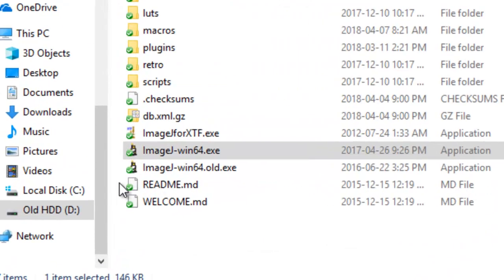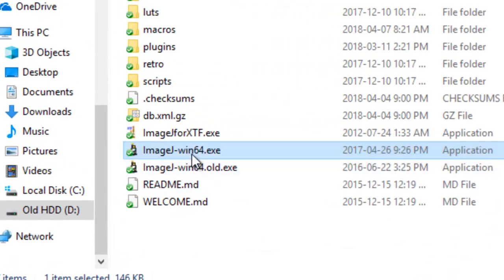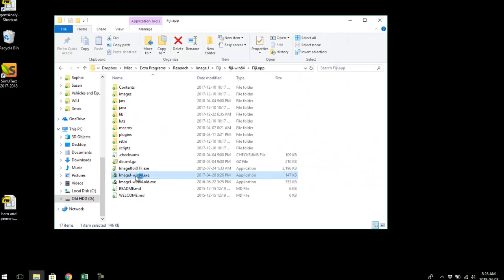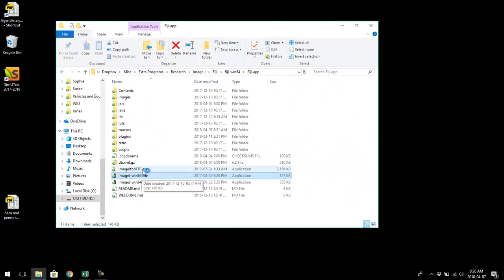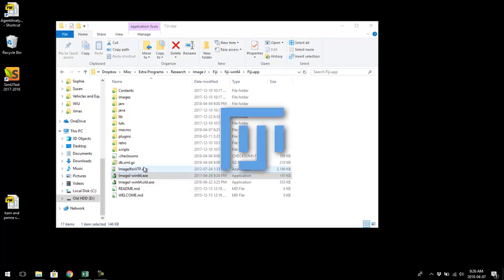The first thing we're going to do is launch ImageJ. The new version is called Fiji. You don't have to install it — you just have to have it on your hard drive and double click the .exe file. I haven't tested this with other versions of ImageJ, so I don't know if it works with older or different versions, but it works with this version.